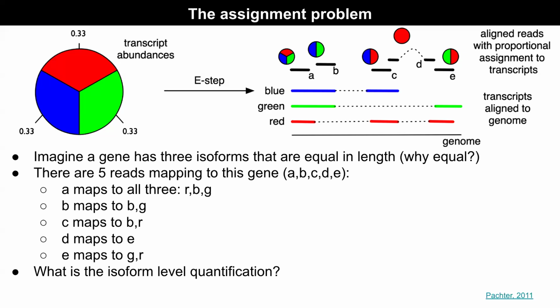Is that problem clear? So the black box algorithm tells you 5 reads map in these locations. You have this information about the isoforms because you have access to the isoform database. You know which isoform looks like what, so this has been previously categorized. This is one possibility of an isoform, this is another possibility, and the red is another possibility. Given this structure, I want you to assign probabilistically which read should be assigned to which isoform. Is the problem clear? Jesh, problem clear?